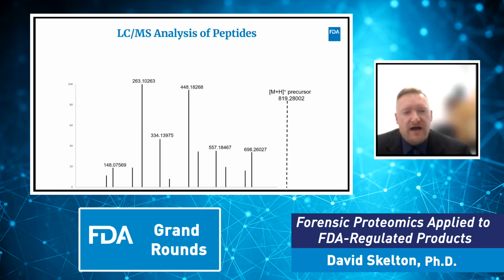Looking at the ion at 148, that corresponds to an N-terminal phenylalanine shown in blue here. If we look at the ion in red below it, that corresponds to a cysteine with the carboxylic acid still on there. So that means it's our C terminus.